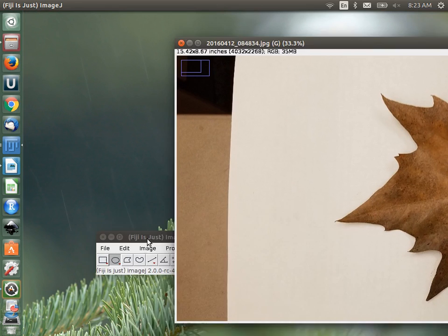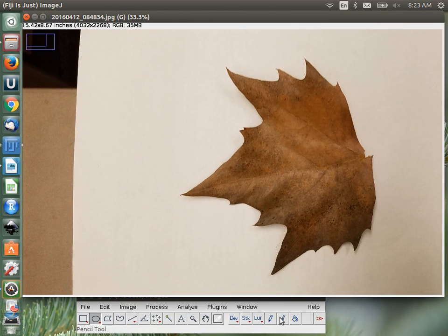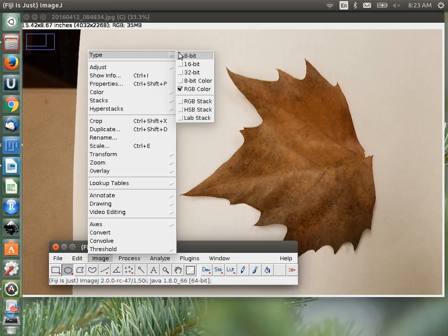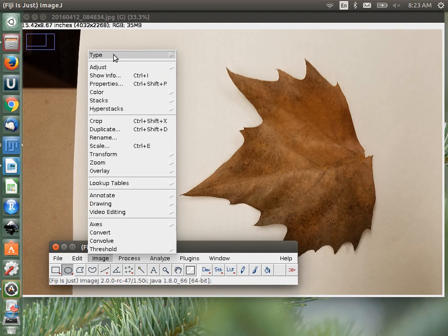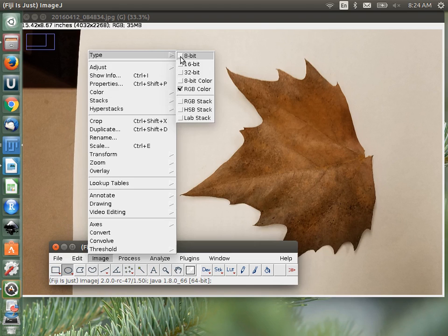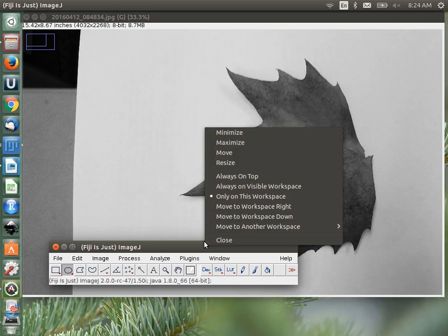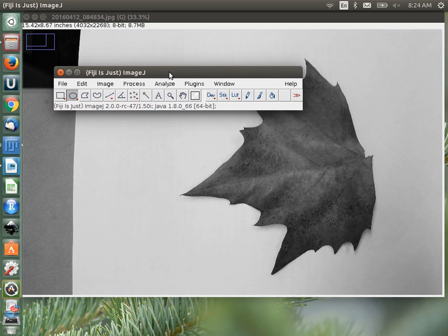To do threshold segmentation, we need to convert the image to 8-bit grayscale. Go to Image > Type > 8-bit. The reason is that a color image has three different channels, each with its own histogram, and we need to threshold based on a single histogram. The 8-bit image gives us that single histogram. Then go to Image > Adjust > Threshold.